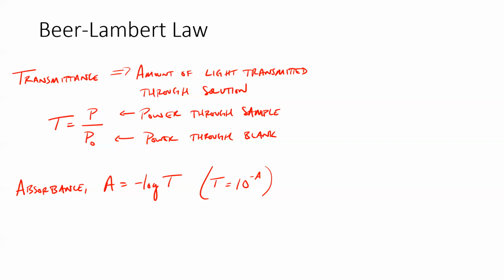So we can do a lot with going back and forth between power, transmittance, absorbance, all these interrelate.